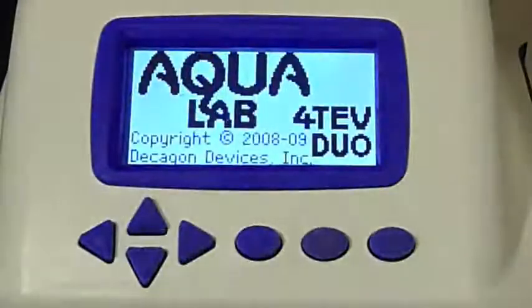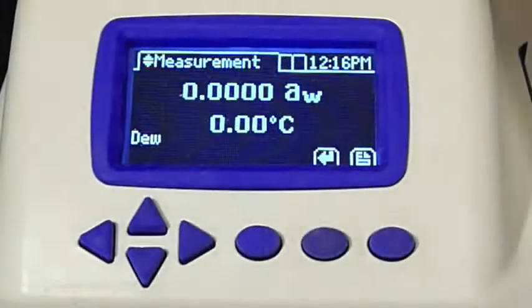If user profiles haven't been set up on your instrument, you won't have to login, and you'll see this screen upon startup. The instrument is now warming up to a preset temperature. I've set the temperature to room temperature, or 25 degrees Celsius. If you're required to read samples at a specific temperature, you would set that specific temperature instead.